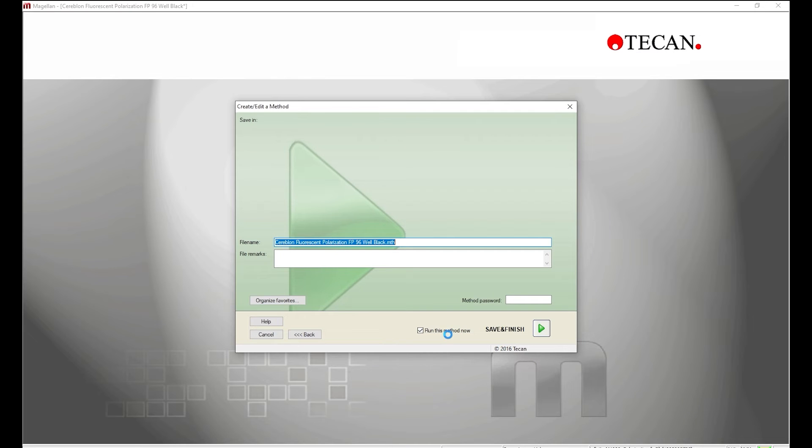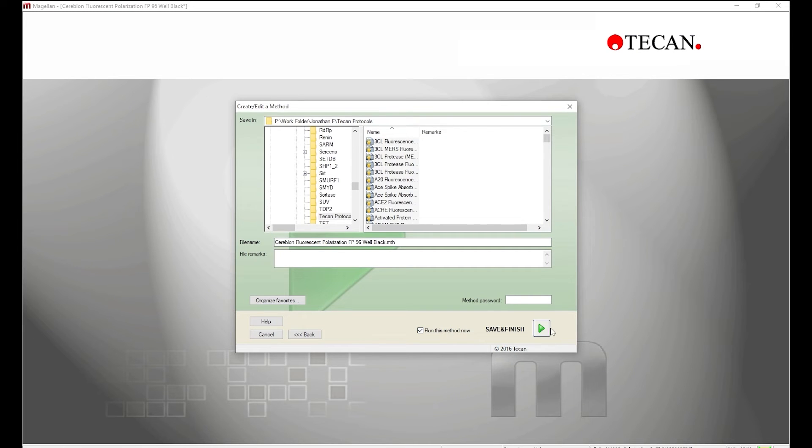Select Run this method now. Select Save and Finish. The method should initiate.